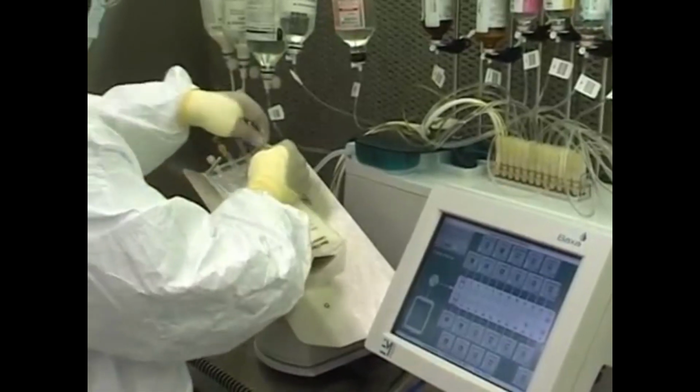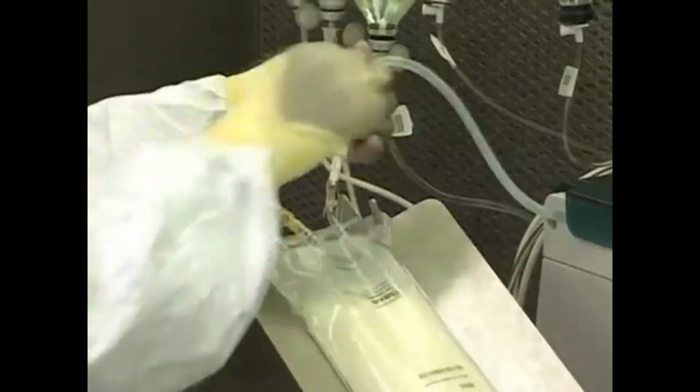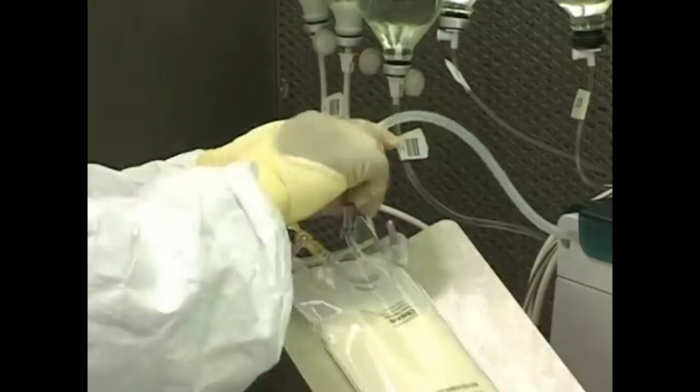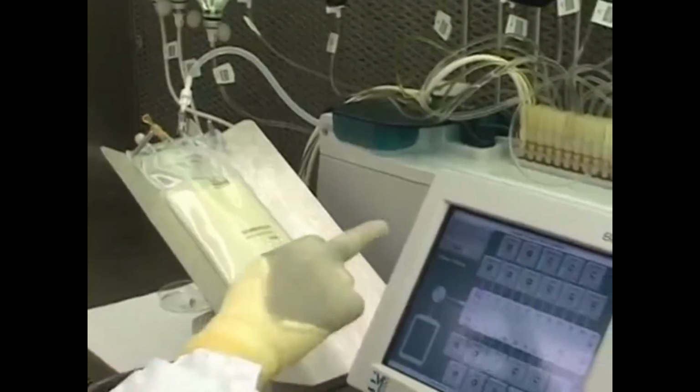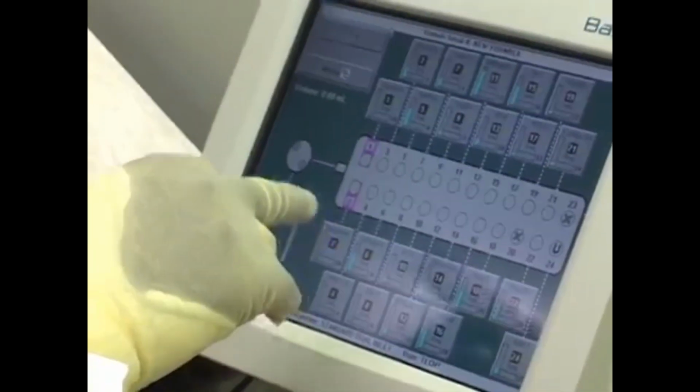The accuracy provided by the ACDs cannot totally substitute for all checks in ensuring the quality of the preparation. Additional safeguards must be built into each step of the TPN ordering, preparation, and administration process. Calculations should be verified, and solutions and their ingredients should be double-checked, regardless of the system used.